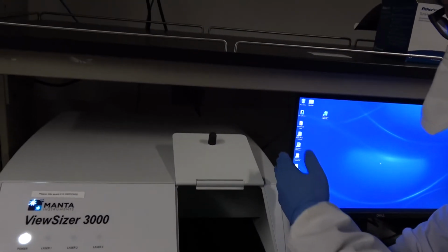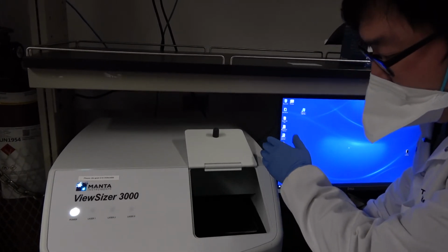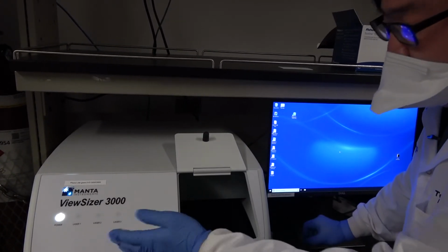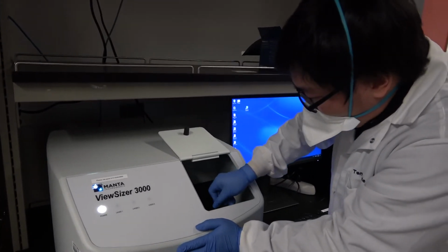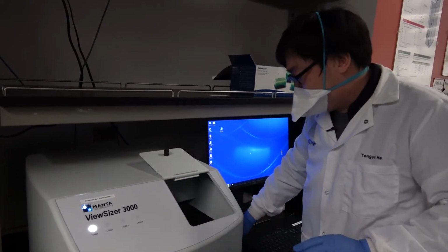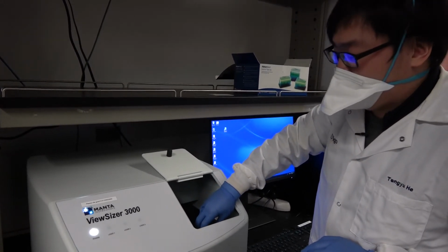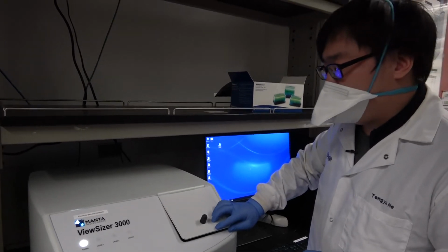In that direction, there are 3 different lasers built in, and in this direction, there's a microscope. Now I'm inserting this cuvette into the instrument, putting in the lid to protect the laser from coming out, and then closing the lid of the instrument.